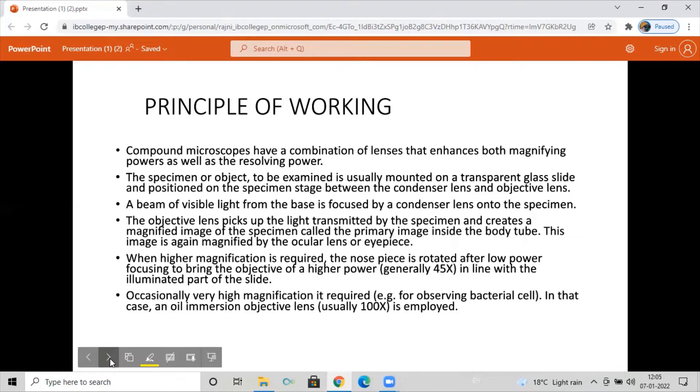A beam of visible light from the base is focused by condenser lens onto the specimen. The objective lens picks up the light transmitted by the specimen and creates a magnified image of the specimen called the primary image inside the body tube. This image is again magnified by the ocular lens or eyepiece.